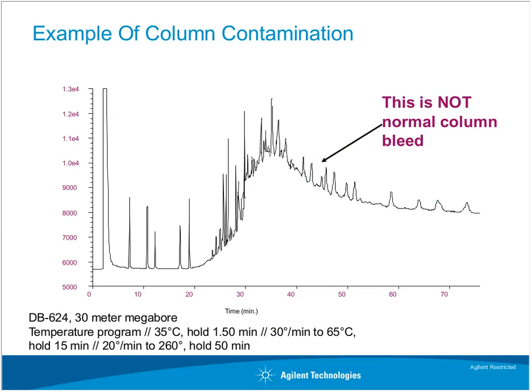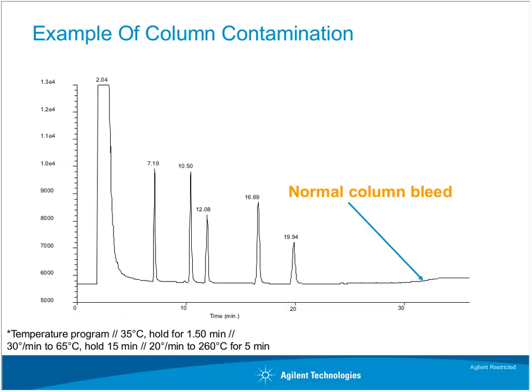So if you're running your analysis, and here's your analysis of these nice looking peaks here, and as it goes up, you see the baseline actually goes up and comes down again. This is all contamination. You got something big here because it's going up and coming back down. Again, it should go up and flatline. So this is all contamination, more than likely coming from your inlet.